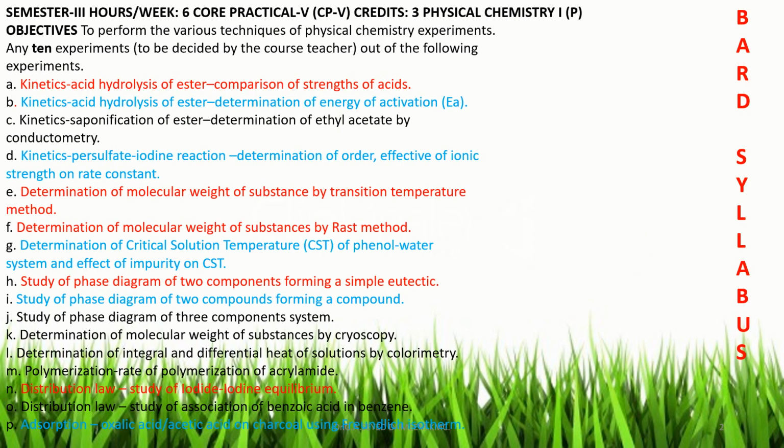This slide shows the Physical Chemistry Practical 1 syllabus of our university. I have discussed 5 experiments. What are the 5 experiments? One experiment, kinetics: acid hydrolysis of ester, comparison of strengths of acids.